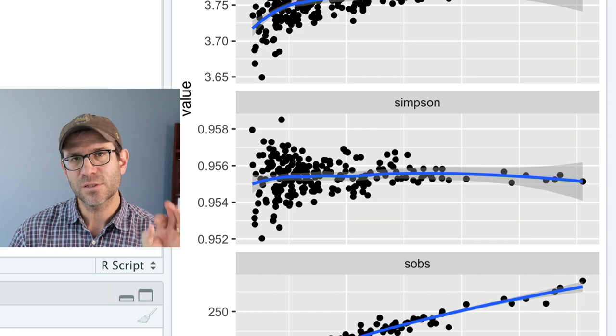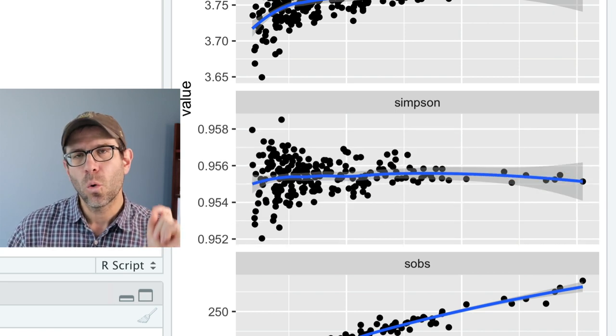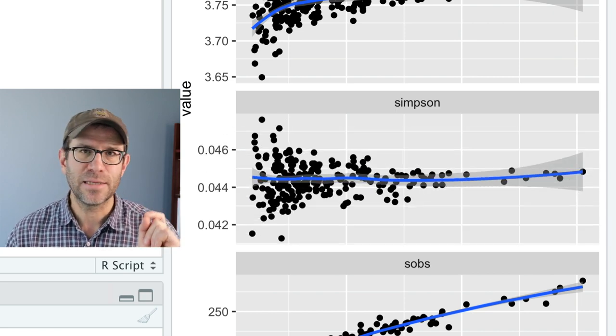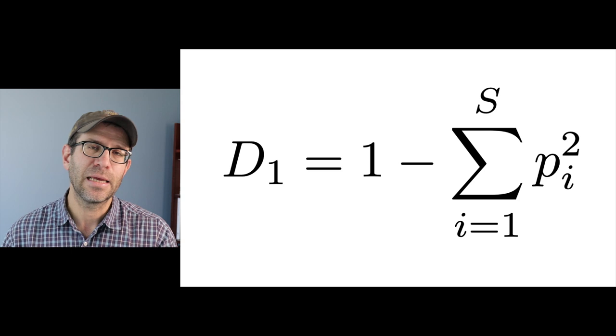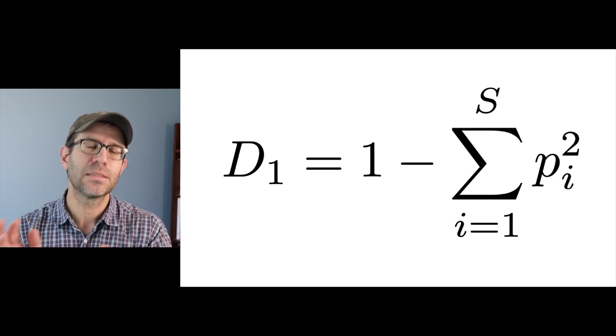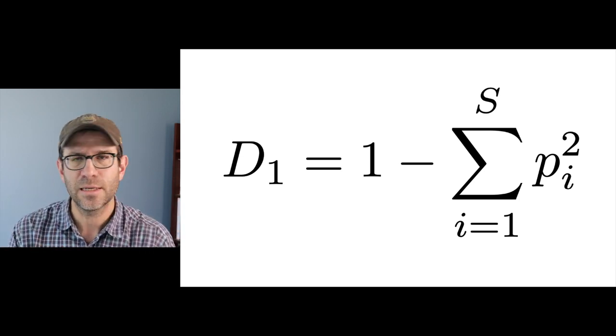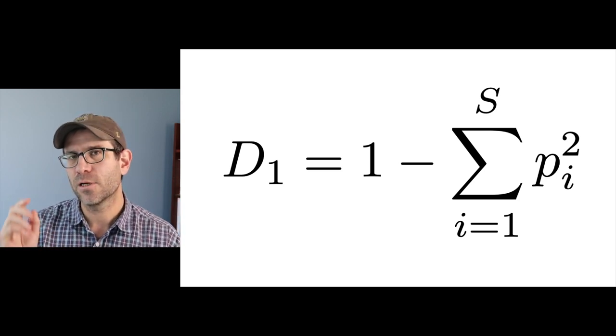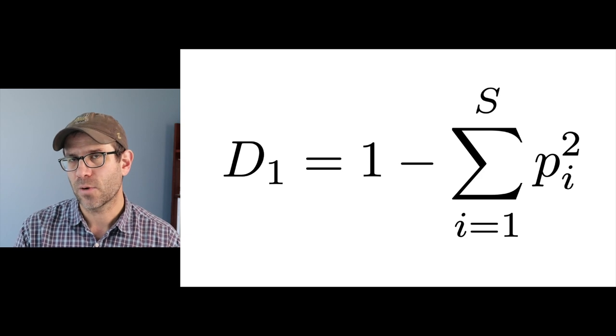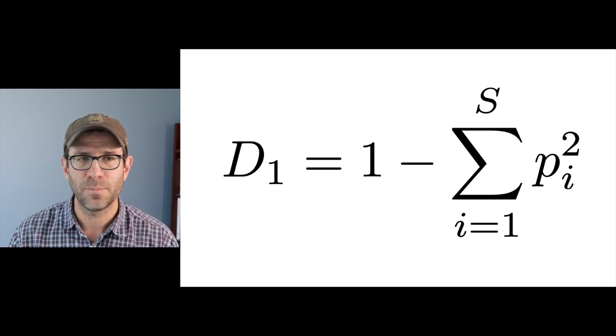So as I toggle back and forth between the vegan version and my version of the Simpson value, you'll notice the values on the y-axis are quite a bit different. One of the things that they do in vegan is that Simpson is one minus the parameter we calculated and actually they're not using the bias corrected. They're using the square of the relative abundance.